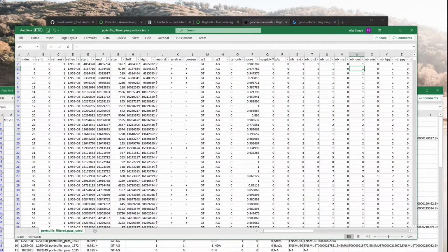You can compare with your P53 knockout, so on and so forth. And these could be your raw counts that you could feed into DESeq2, for example, to find out if there's a difference in splicing reads across this junction for P53 mice that have been irradiated, for example.